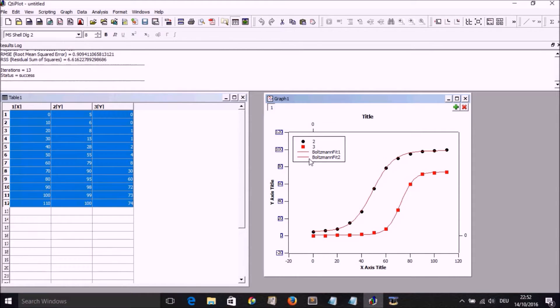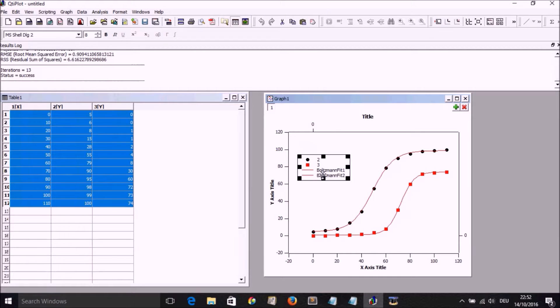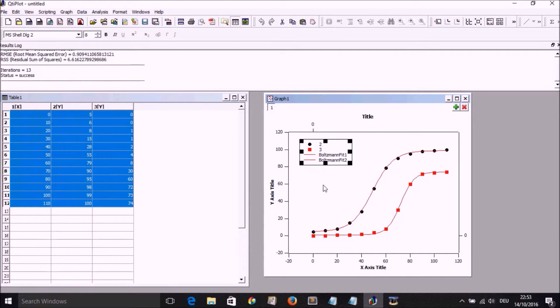And the legend, as you noticed before, could be moved within the graph.